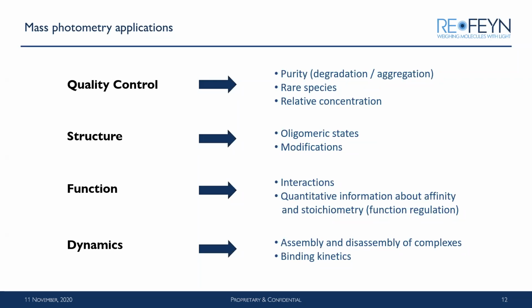And what I'm going to do now is take you through a series of different applications and different systems, showing examples of all the applications and what you can do with that, and what we can benefit from mass photometry.